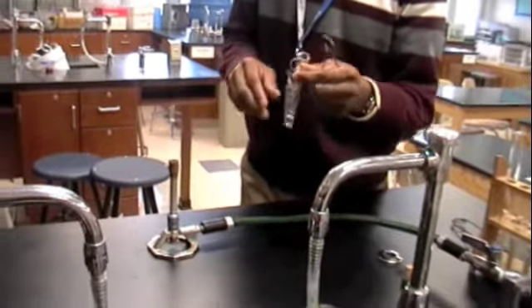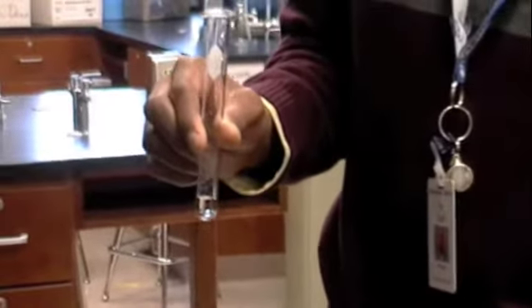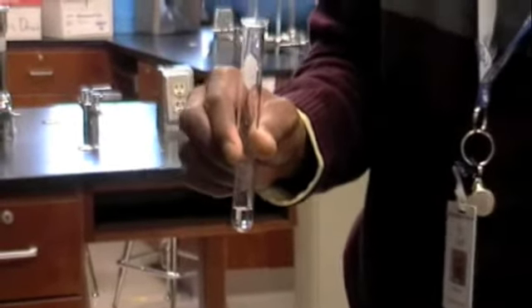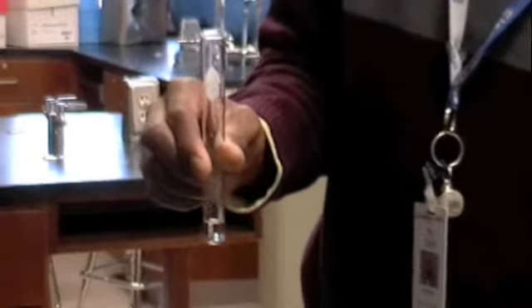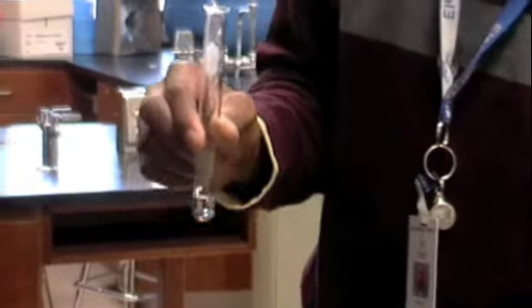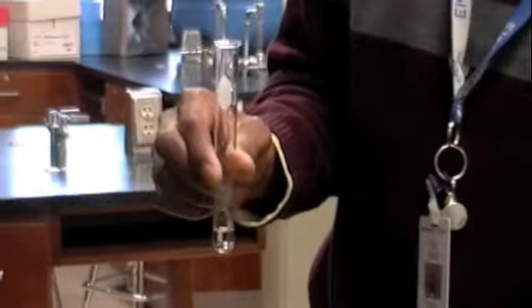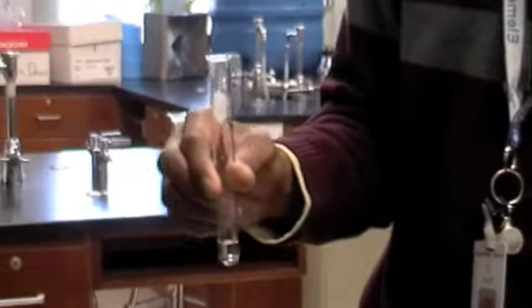Okay, this is an assessment lab, and basically what you need to do is make 3 to 4, possibly 5, actually go ahead and make 5 good observations that are written in complete sentences. Once you're done making the observations of what I do, go ahead and explain what is happening and why it's happening. Make sure that you use everything that you learn from the kinetic theory in terms of what molecules do and how they behave when they're heated and cooled in your explanation.